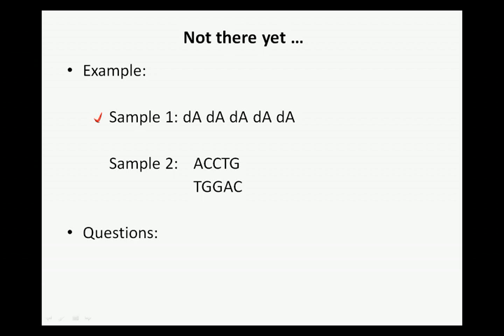Now, you get it to react with diphenylamine, both of them. The first question I have for you is, would you think that you would get the same absorbance out of both samples? Now, if you think DPA, we say it reacts only with purine containing nucleotides, so it will react with all of these molecules here, right? 5 of them. Now, what about in these samples?